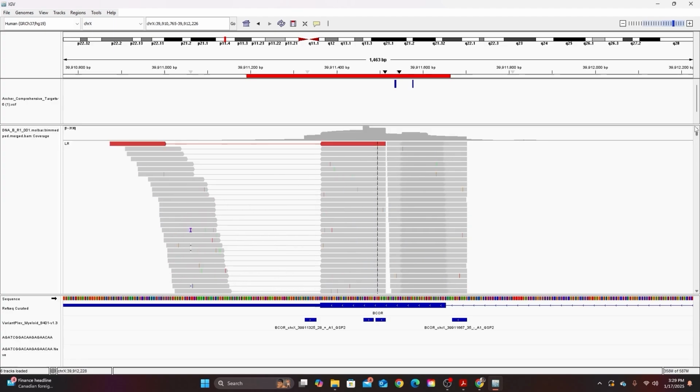The only way you could have a structural variant with no soft clip bases is if the insertions, inversions, or translocations began exactly at the start of an amplicon and ended exactly at the end of an amplicon, for every single amplicon, so that the entire amplicon could be aligned to the reference genome. Maybe it's being aligned in the wrong place, but we wouldn't be able to tell if the amplicon were the exact size of the structural variant.